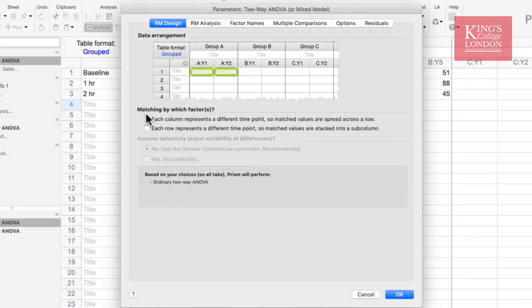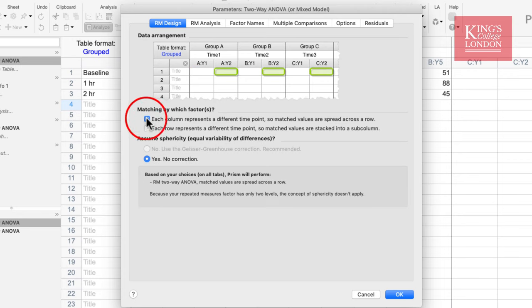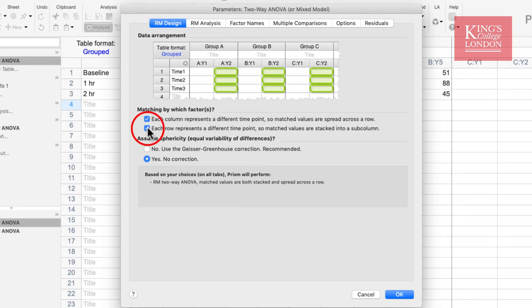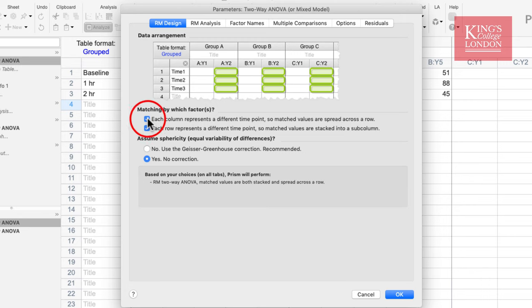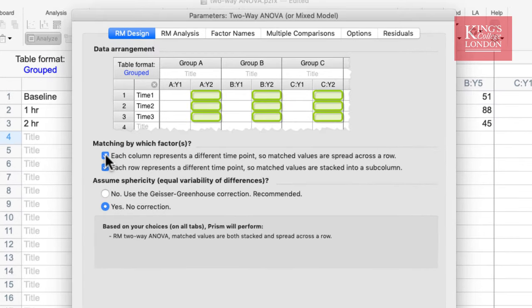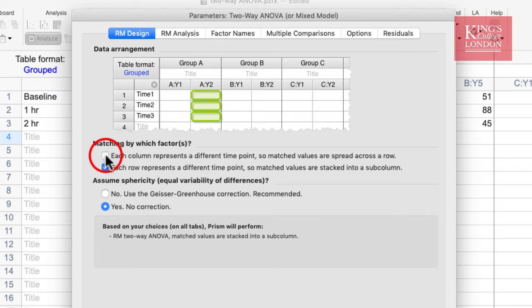If you have chosen repeated measures, you have a choice as to how your data are matched: either each column represents a different time point so matched values are spread across the row, or each row represents a different time point so matched values are stacked into a subcolumn, or both are true. Prism gives you a handy graphical hint at the top of the data arrangement window. In most studies, you might use data where each of the Y columns represents a different time point measured in the same entity. However, as I said, in this case we are not using repeated measures.